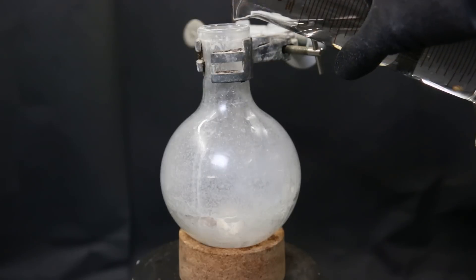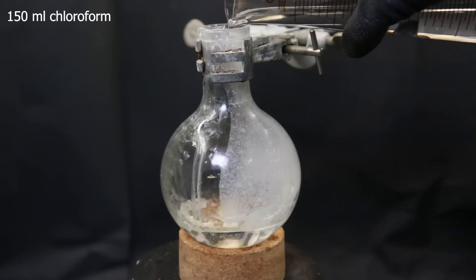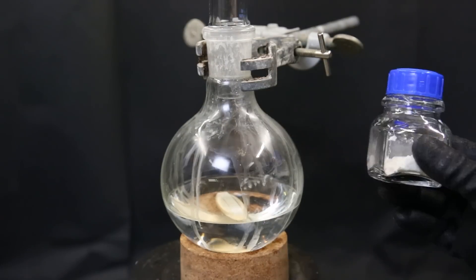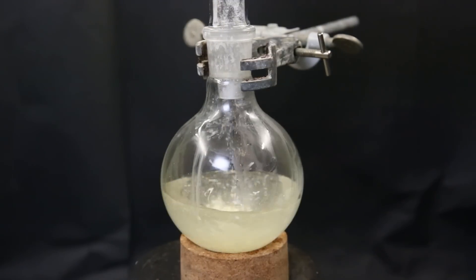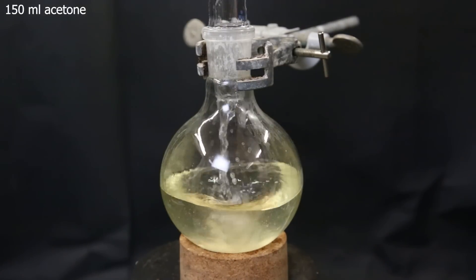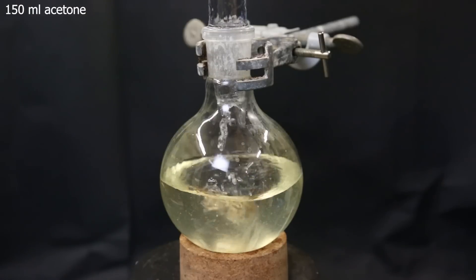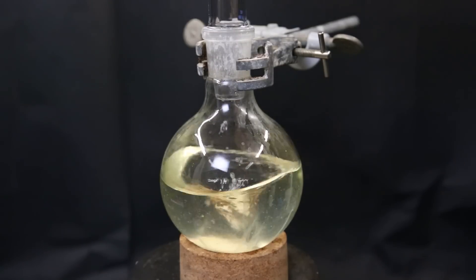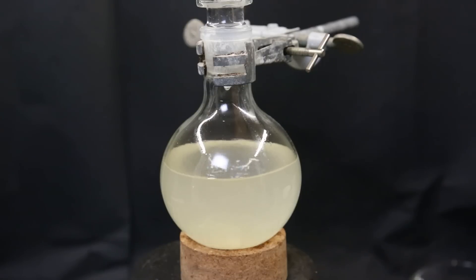So to the flask that still contains a bit of the product, I add in 150 ml of chloroform. Then to the chloroform, I add in all of the product that I collected. When it looked like most of it had dissolved, I added in 150 ml of acetone. I let it stir for a while, and we can see that the mixture has turned cloudy.